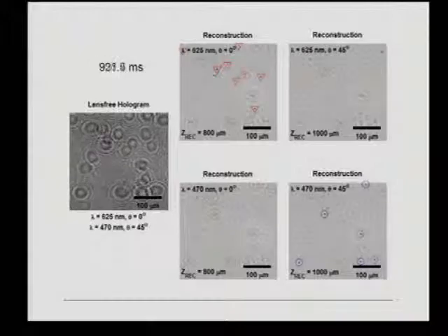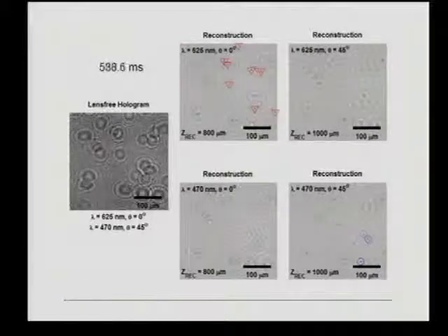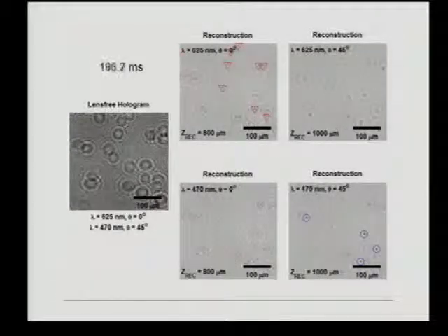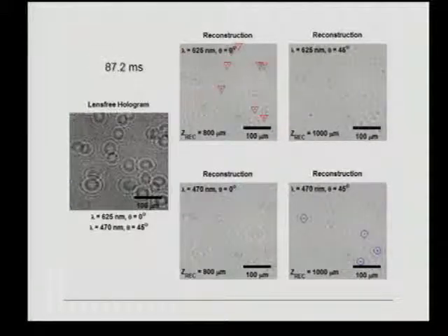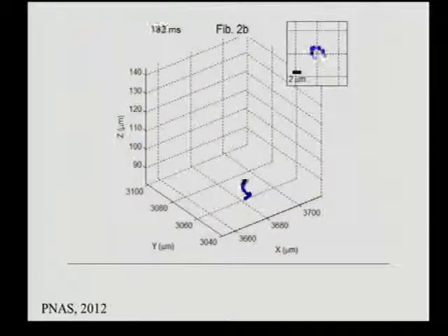And I emphasize that this is simultaneous acquisition, which means they eat away each other's contrast. The blue hologram eats away red contrast, and vice versa. By having the correct reconstruction parameters, you can see the volume in two perspectives and pinpoint the XYZ position with sub-micron total localization accuracy, with the same throughput across the 10 microliters.